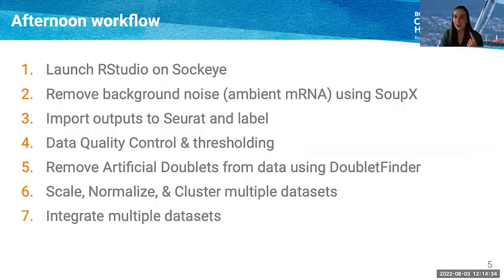We're going to start by launching RStudio on Sockeye, go in and use the SoupX package to remove background noise and ambient RNA. Next, we're going to bring the outputs of that SoupX function into Seurat, and we're going to do some labeling. We're going to make some metadata labels.